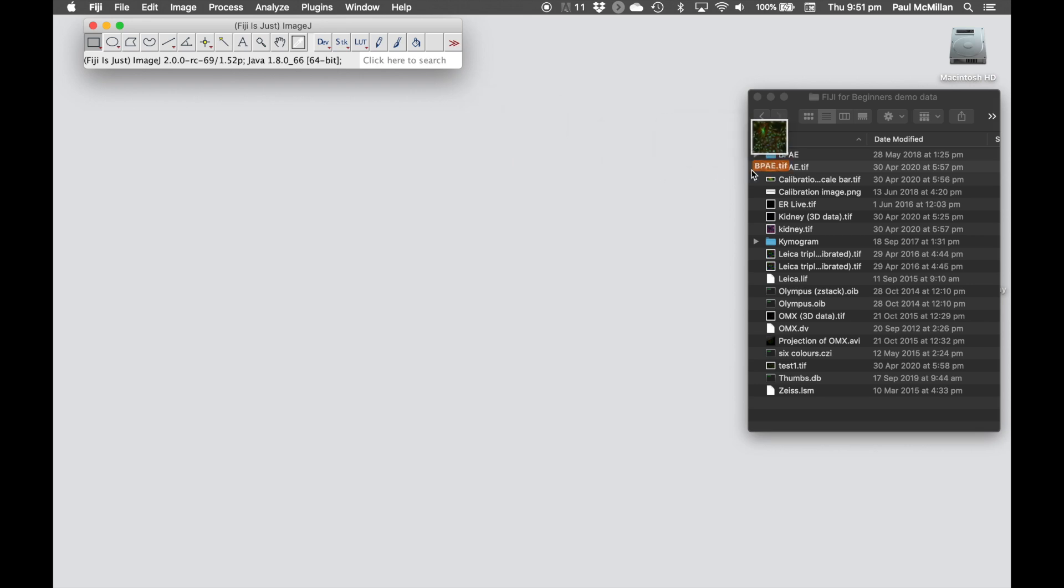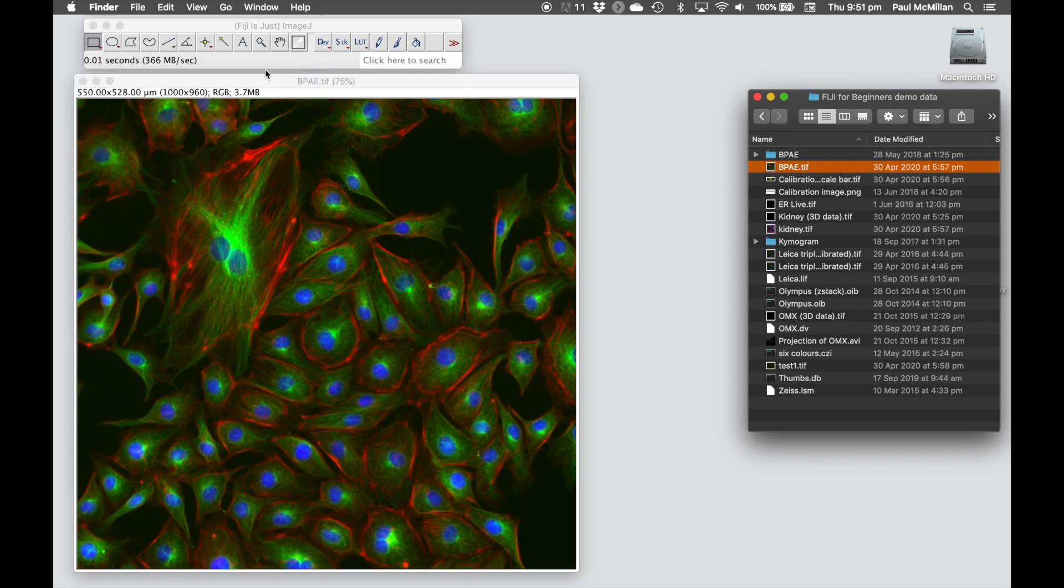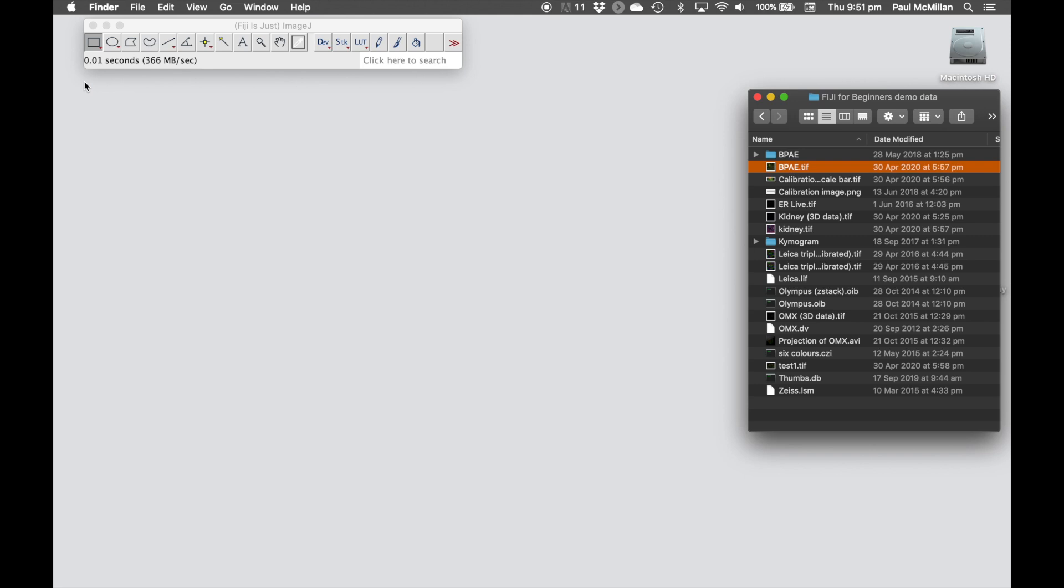Opening up a TIFF file just automatically opens up that image. If we go through and try to find a different file format, say for example a Leica file, this is a .lif file.